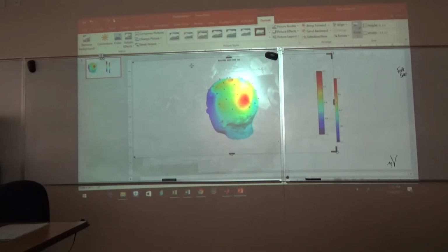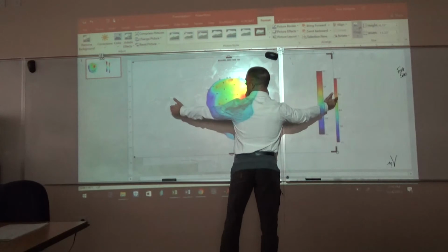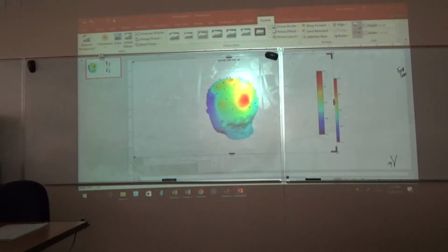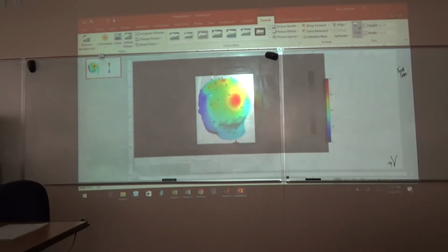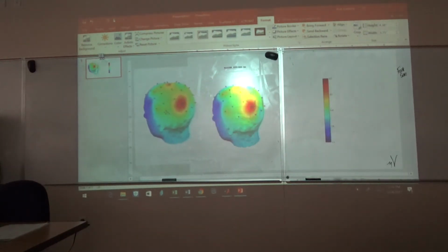Okay? So, what you can do is use these little black bars to edit and crunch this in. So let's take all this white space and crunch it in to just what we need here. Boom. Just like that. And then just bring it down there, right there. And then you hit crop again, and it finishes it. So let's move this over to the left.